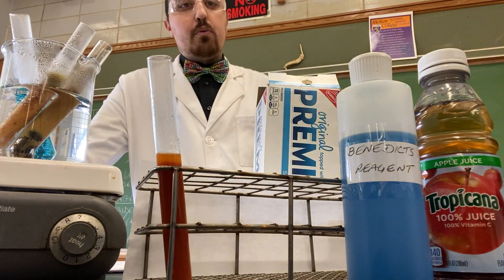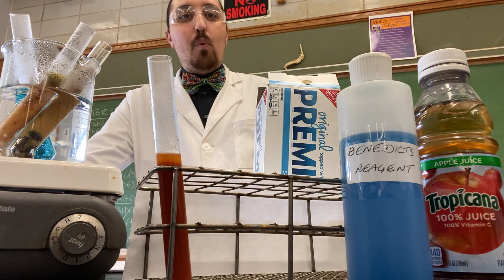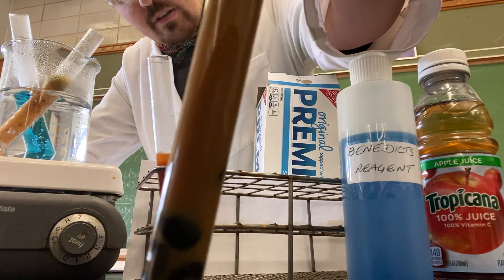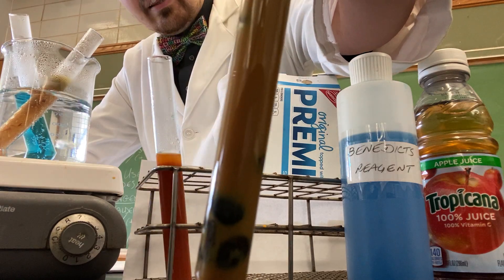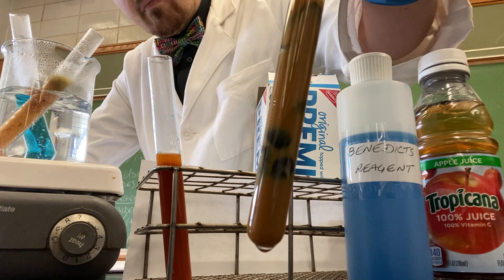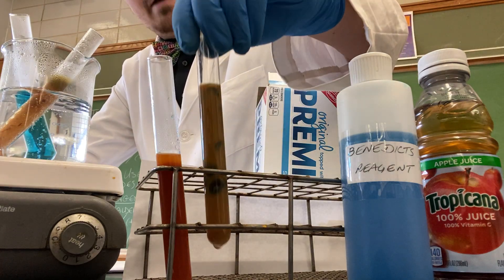We also threw in some raisins, water, and Benedict solution. The solution has turned a light orange, dark yellow color — not as dark as the apple juice.